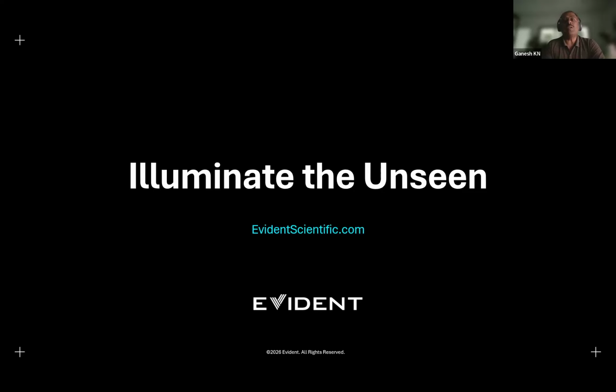Yokogawa came out with a new module called super resolution by optical reassignment, by implementing a microlens on the emission side also. It has further reduced the point spread function, or the PSF, and the resolution was improved to 140 to 150 nanometer. But the gold standard of the structured illumination was 100 to 120 nanometer.